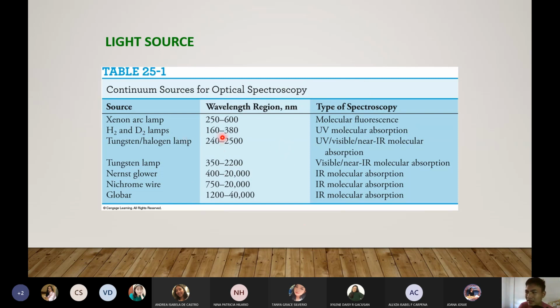And so take note that ito yung deuterium lamp, sabi ko sa inyo, ginagamit yan sa UV, no? Okay. And then some of them can be used in the visible. Okay. So pwede tandem yan, no? Pwedeng may deuterium pati tungsten lamp yan. Okay. Or pwedeng tungsten lamp lang meron. Okay. Pwedeng combination of the two. Okay. So yan. Itong IR naman, infrared, later kwento natin ano tong IR na to, no? Okay. So yan. Basta ang concept lang is dito sa UV visible, pwede mo to gamitan ng Beer's law. You can use Beer's law here. I think sa fluorescence, pwede rin yung Beer's law.